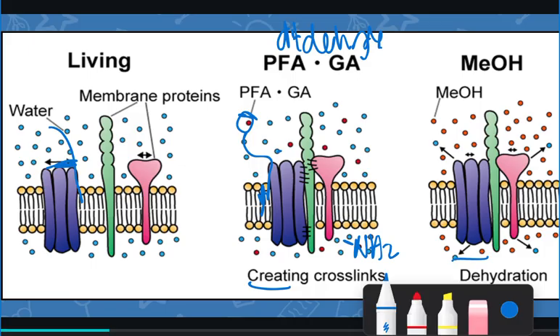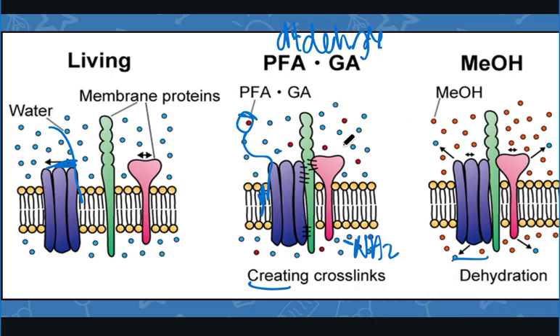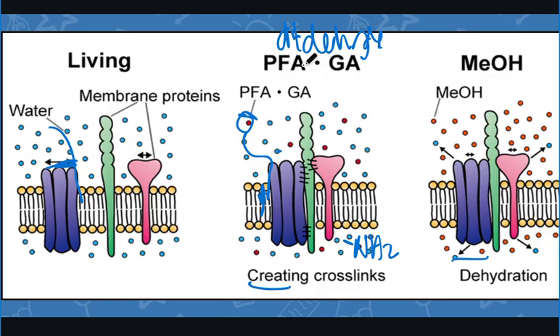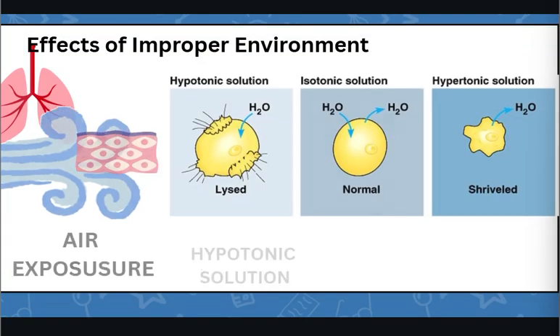So it's not really a true cross-linking compared to the aldehydes, but it still immobilizes the proteins. Usually this methanol fixation is often used in cytology and immunofluorescence for permeabilization. I hope it is clear.